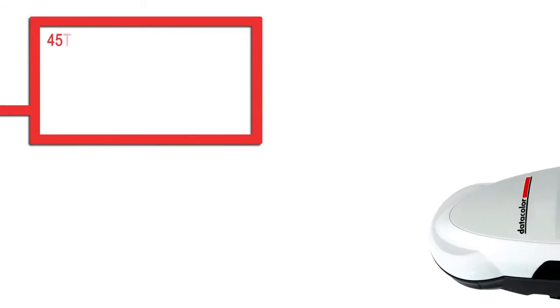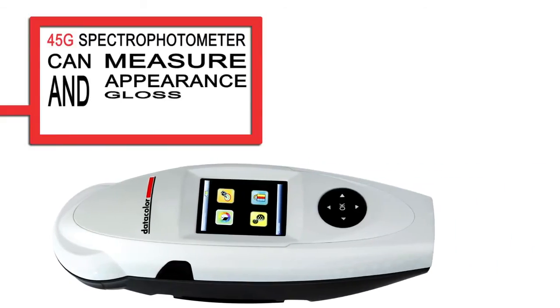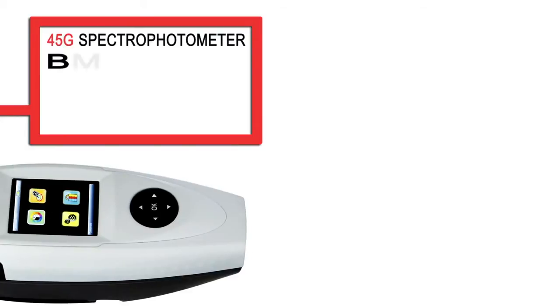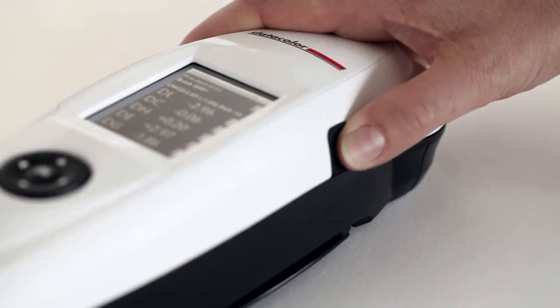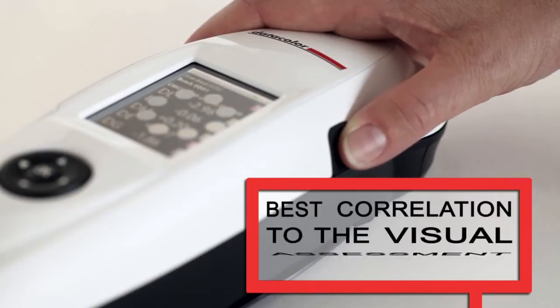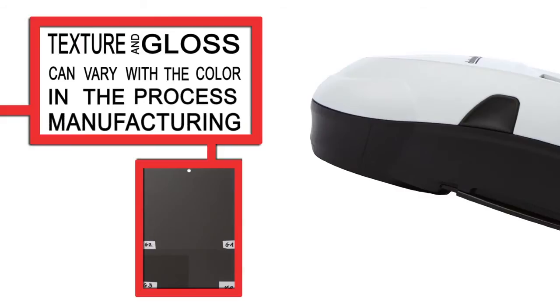The innovative 45G spectrophotometer from Datacolor can measure appearance and gloss simultaneously due to the built-in 60-degree gloss metre. Its 45-0 geometry has the best correlation to the visual assessment, especially if texture and gloss can vary with the colour in the manufacturing process.